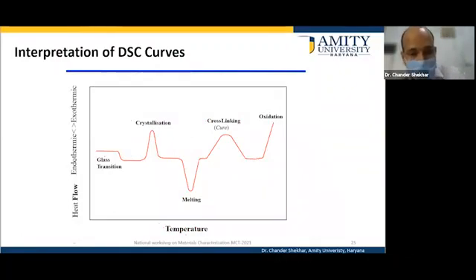For a given endotherm, there are various types of processes that may happen. For example, in the case of polymers, initially there is a glass transition. The heat capacity of the polymer changes, and that is represented as a kind of stepwise transition in the thermogram. And if there's a polymer, it may crystallize, giving the crystallization peak, which is exothermic, on the upward side in this case.